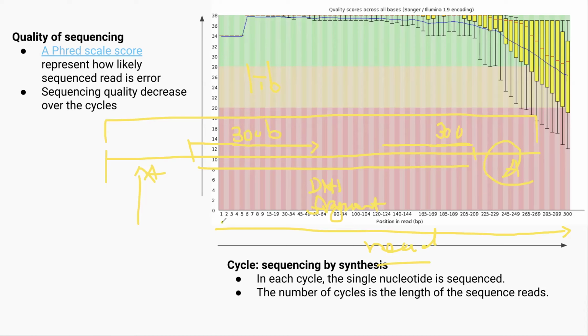Okay, so what is the first position? Here? No, this is the first position. Okay, and second position, third position, up to the 300th base pair position, right? So this is the relationship between the library, fragment, adapters, reads, and each cycle position. You have to remember these things, otherwise you cannot understand everything afterwards, right? So this is the key thing in this lecture.